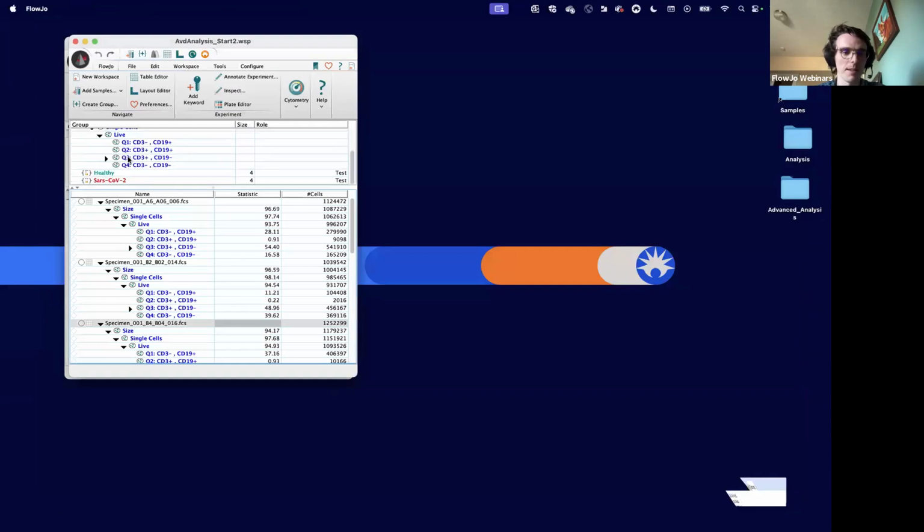I've split the data up into 4 samples in the healthy condition and 4 from the disease. I chose to do an even number of samples from each just so it's more comparable. T-Rex will only compare an even number of cells from each of the 2 conditions, so might as well just make things even from the start.